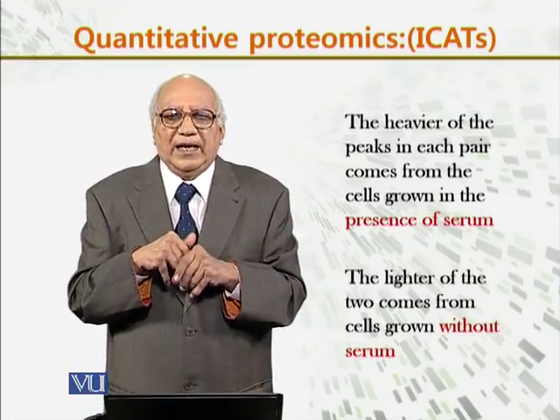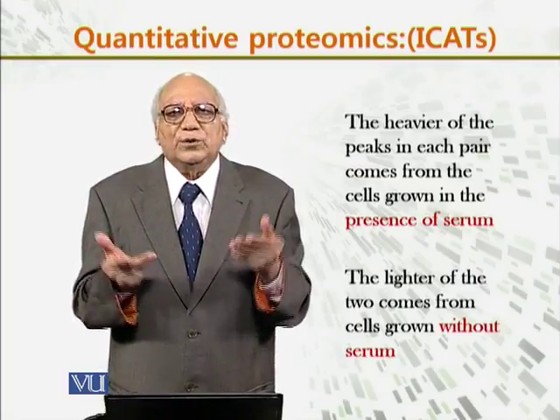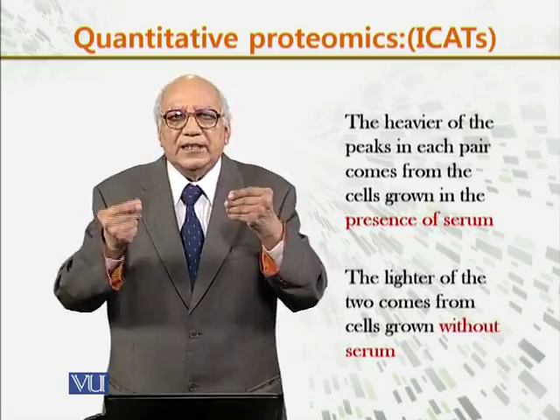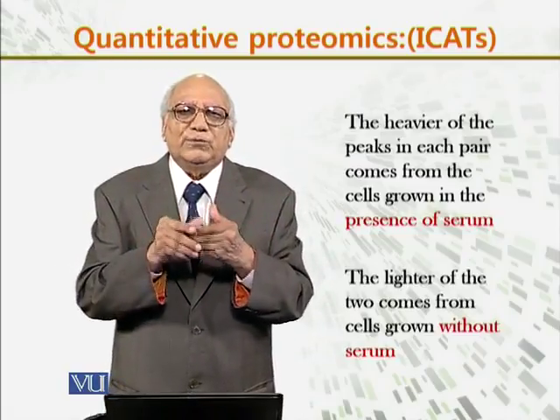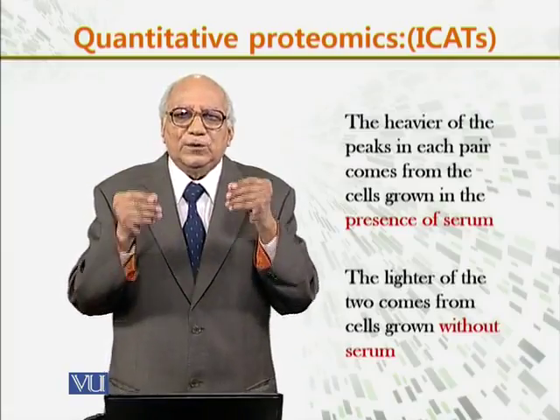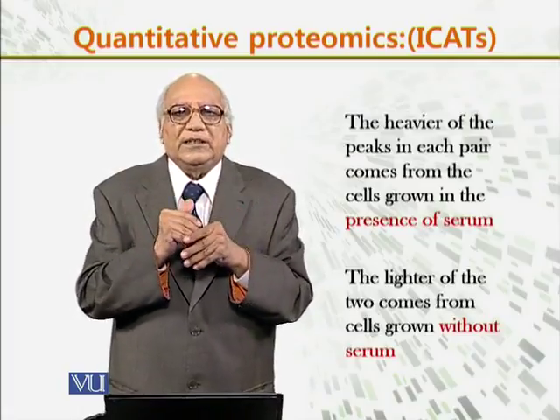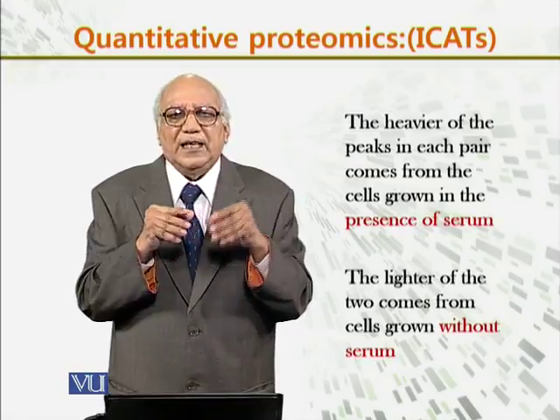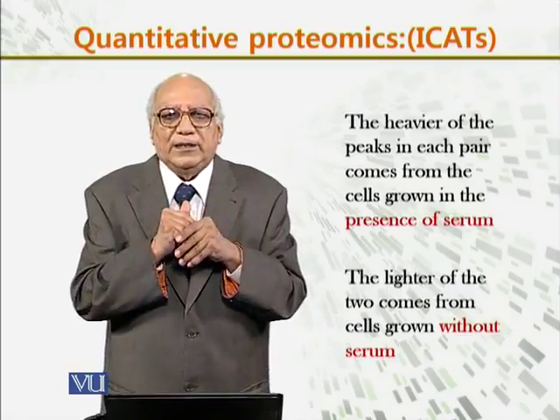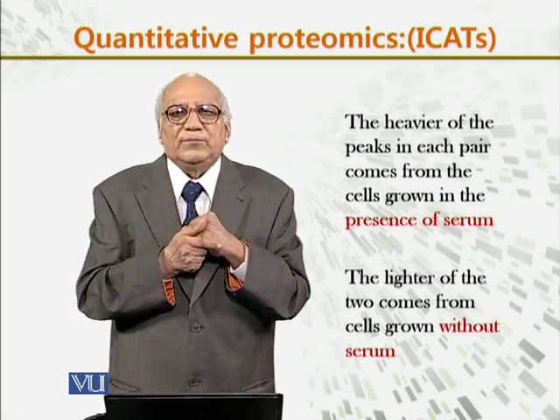The lighter of the two comes from the cells grown without serum, the lower peaks which we get. This helps us to differentiate between the two sets of proteins, to distinguish their weight and determine their mass, and to quantify the different proteins.